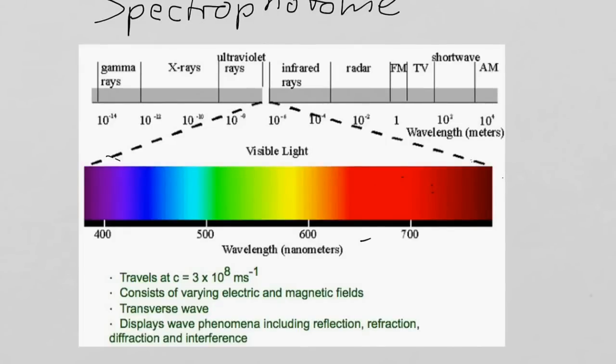Chlorophyll is a very precious molecule, and the plant is trying to recycle it. So it degrades the chlorophyll, and therefore there is no absorbance any longer in the red and in the blue range. Instead, there are other plant pigments in the leaf that you usually don't see, because they are just covered by the chlorophyll.